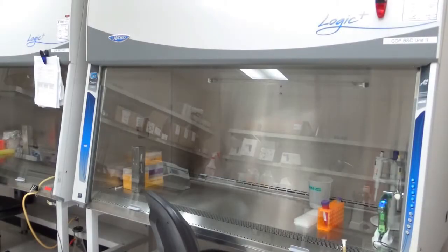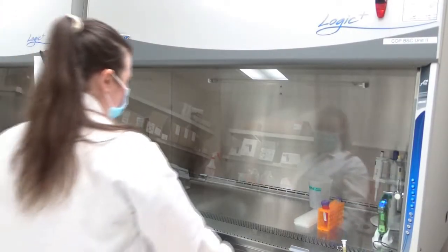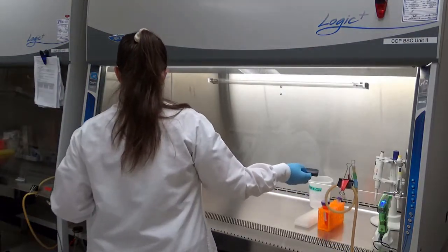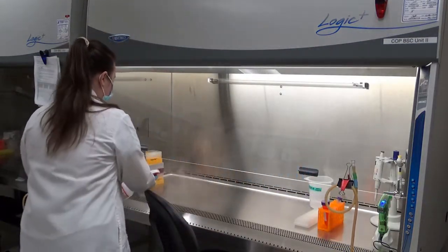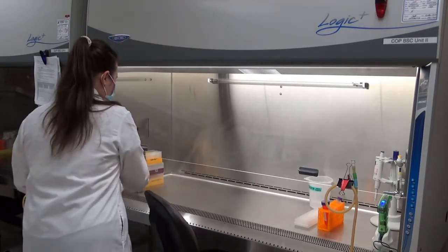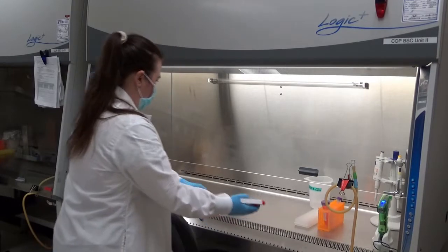Before you retrieve your cells, make sure the sash of the biosafety cabinet is at the proper level to allow for ideal airflow. Sterilize the hood with 70% ethanol and have all required supplies at hand. To minimize airflow disruption, try to work in the middle of the hood space.